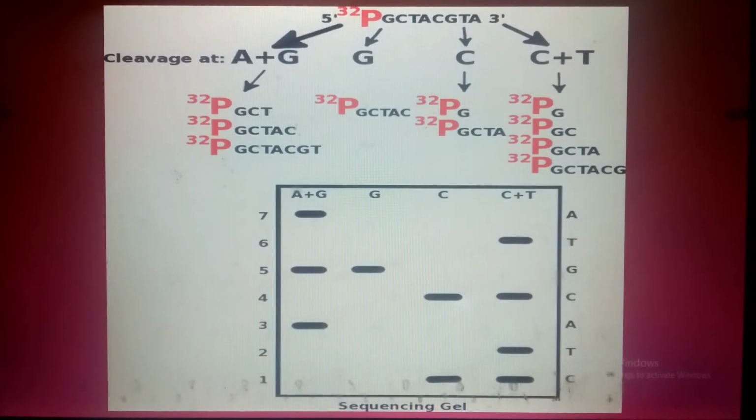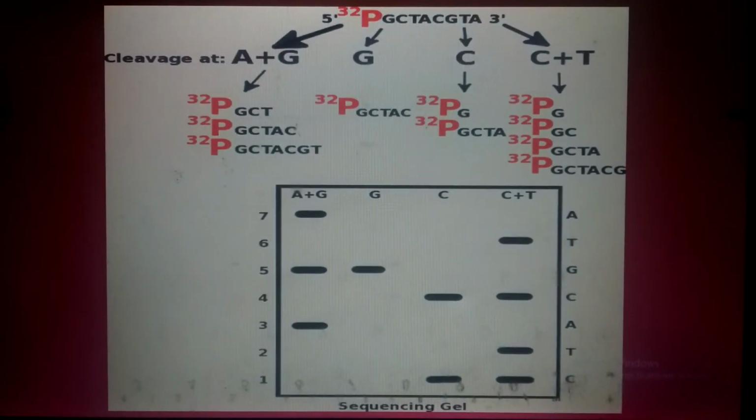Okay. Now I'm showing you what will happen after modification and cleavage by piperidine. Different fragments will be produced.